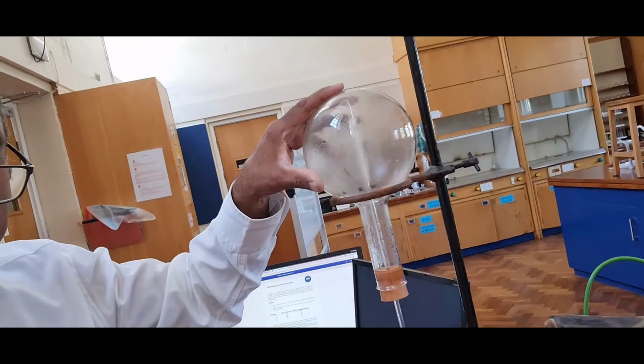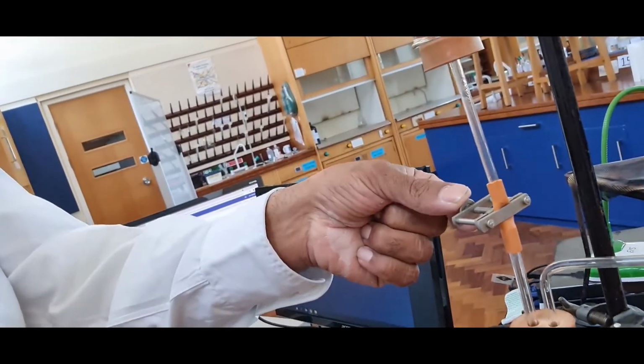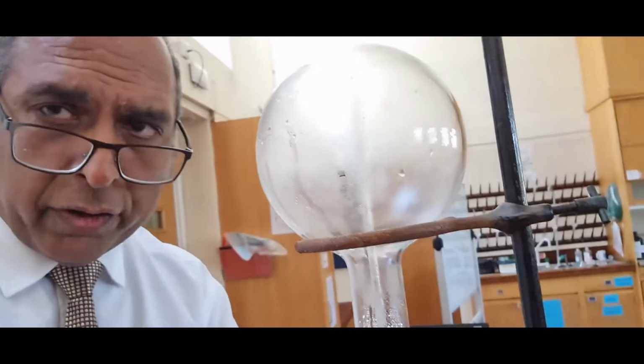Now, ammonia gas is a very, very soluble gas. It dissolves in water very easily. And look, if I open this tap, that's connected to this. I'm going to open the tap now. Well, not now. Let me explain it first, because it might happen rather quickly.